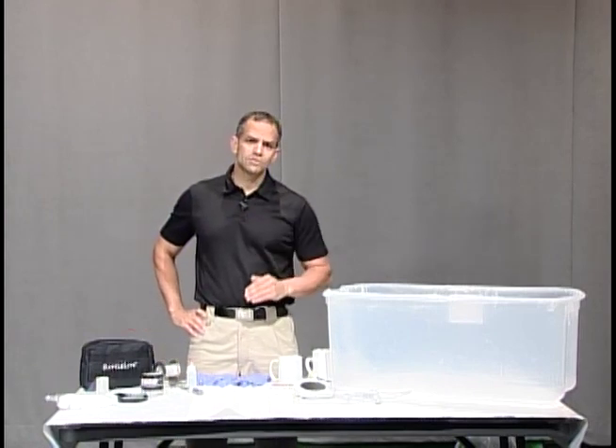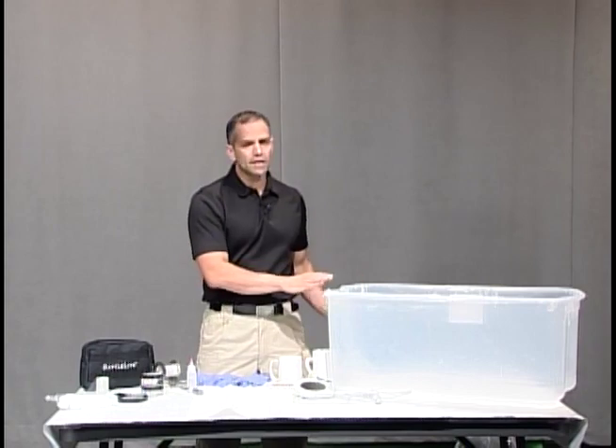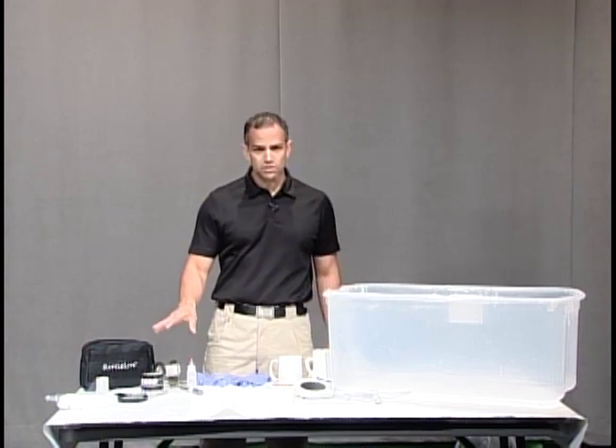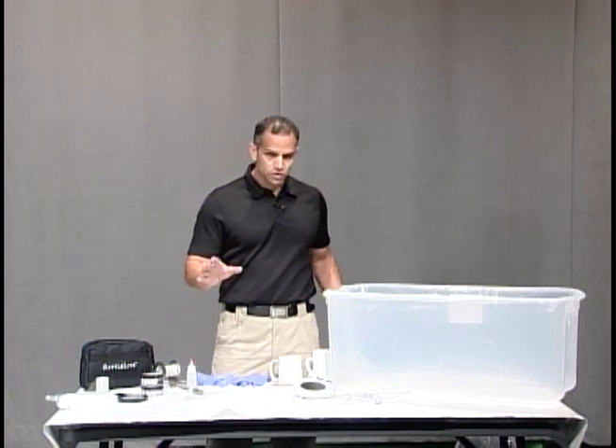Hi, welcome to Forensic Education. I'm Sergeant Mike McCutcheon. Today we're going to cover basic fingerprinting and setting up our portable fuming chamber. We're going to then lift that fingerprint that we fume in our fuming chamber with just some basic black powder and a regular duster. So let's get started.